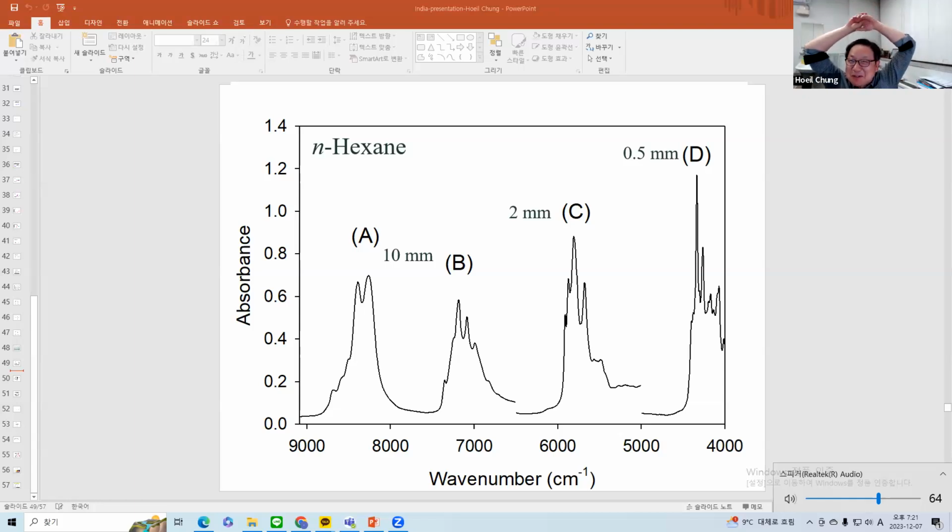I think PLS is working very fine, but recently there are many different types of modeling, like support vector regression, or neural network based or deep learning based. But if you want to use deep learning, I think the number of samples should be a lot. So far, I think PLS is working fine. Also, PLS is more explainable compared to deep learning. If you go deep learning, inside is totally a black box, right? In the PLS case, maybe it is a kind of black box, but we can show the loadings or something like that, so it is more insightful about what you have done. At this moment, I think PLS is still a safe way to use.